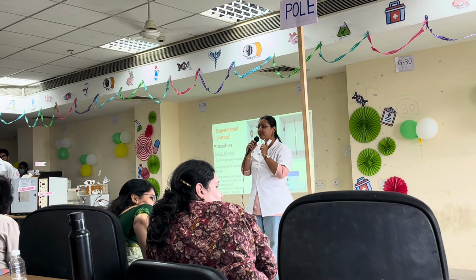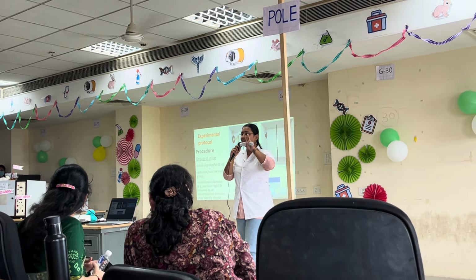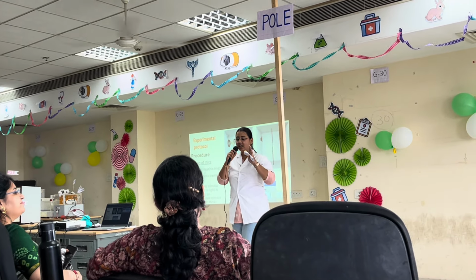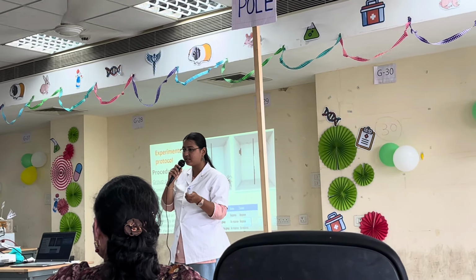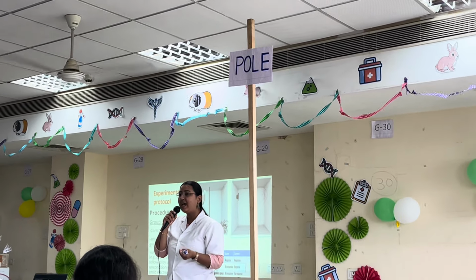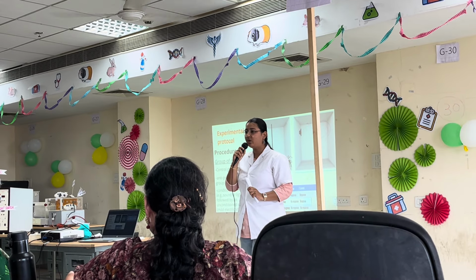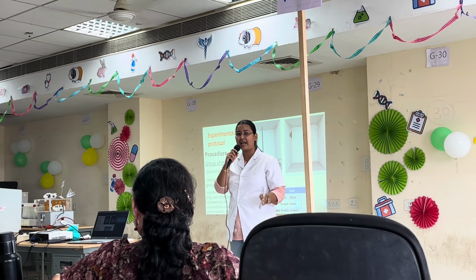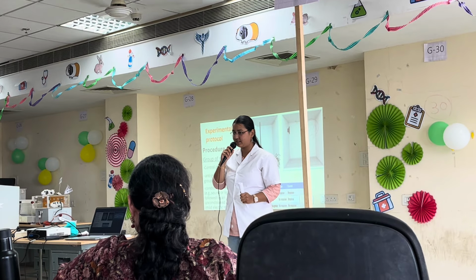So what we're going to do is, first we're going to train the mouse. The training phase consists of 4 parts. In 3 parts, we're going to have an unconditioned response, and then for the 4th part, we'll have a conditioned response and explain how it goes back. So in unconditioned response, we'll provide a stimulus in the form of a buzzer, which is sound. And then we'll provide the second stimulus in the form of electric current. So as the mouse senses the stimulus, a response is generated, which is climbing the pole. Let us see how this experiment goes. Part 1 of the training phase.